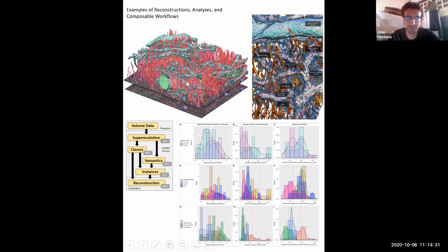So this pink is like a forest of axons, this blue is the dendrites intertwining with them, and here I have a zoom cut out of the same one where I'm showing you that we also annotate these structures inside of these neurons, which are involved in signal modulation and are also very important for studying neurodegenerative diseases.